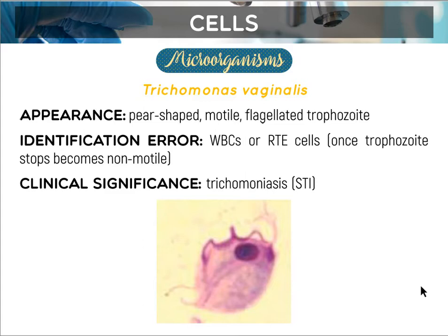This is usually associated with vaginal inflammation. Trichomonas vaginalis is easily identified in wet preparations of the urine sediment. One thing you take note of is its rapid darting movement, okay? Rapid darting movement, see Trichomonas vaginalis. So, report it as rare, few, moderate, many per HPF.